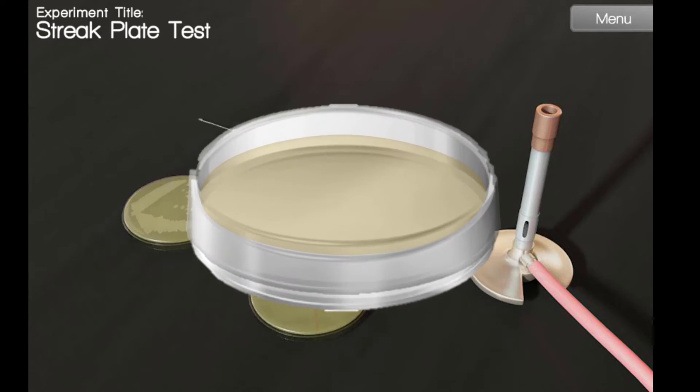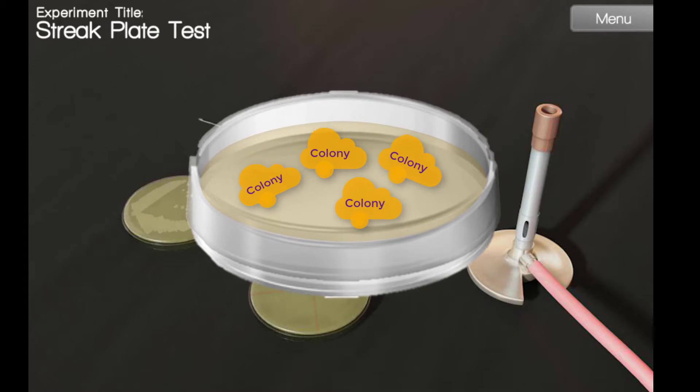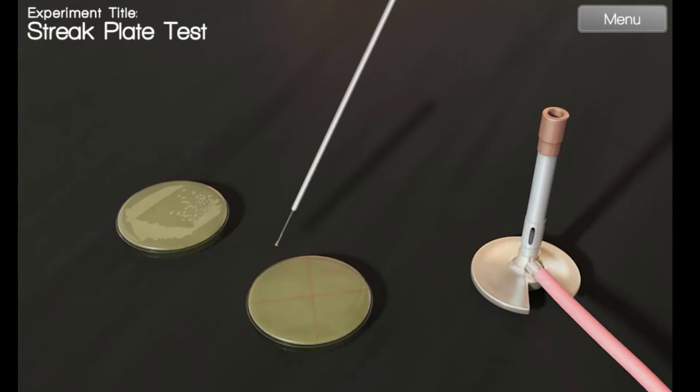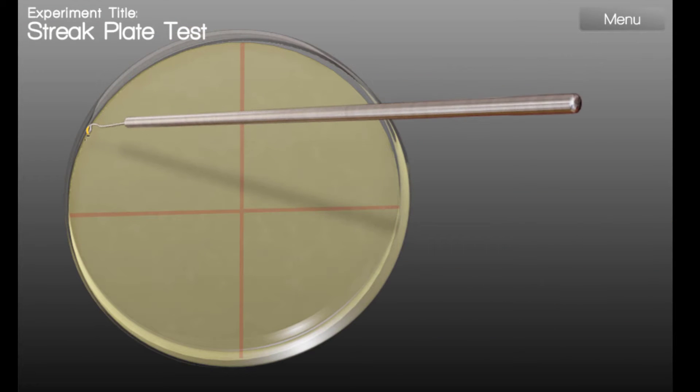However, isolated colonies should be growth originating from only one bacteria. Our objective is to choose bacteria from one of these pure colonies and create a pure culture using the streak plate method. Let's begin.